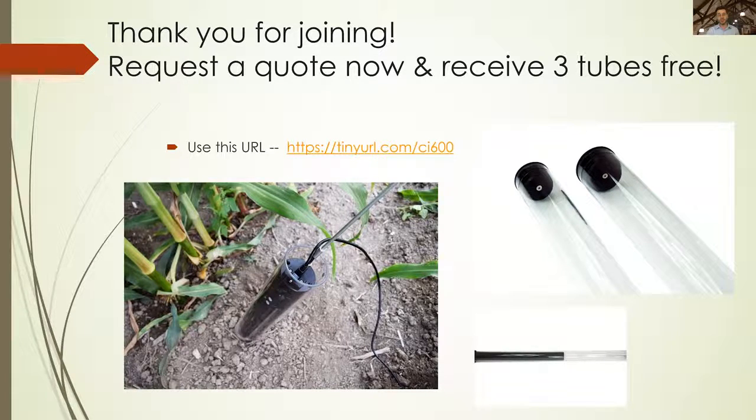Once it's actually installed and you make sure that there's no water and the installation cap is on, you should be able to use that tube repeatedly pretty much as long as it's clear. If you do get water into it, and say you have a standing amount of water, I definitely highly suggest don't put the 600 or 602 in there. That will likely damage it. It's kind of hit and miss. What we do suggest is make sure that you drain out that tube if you're going to continue using it.